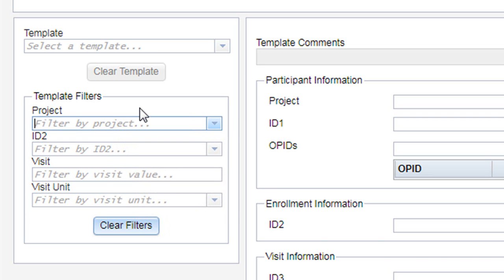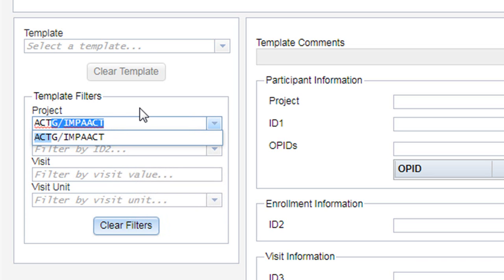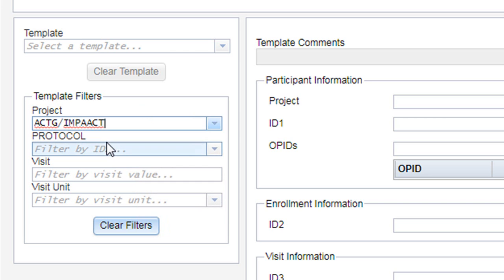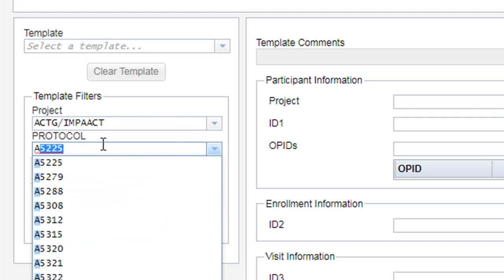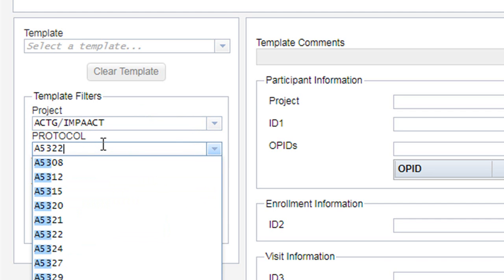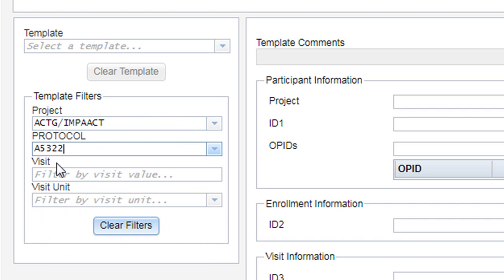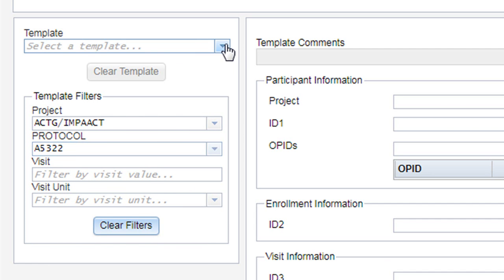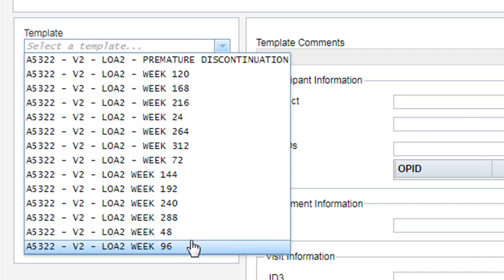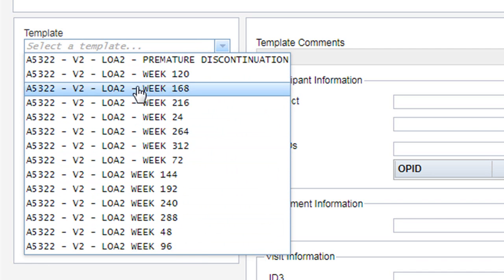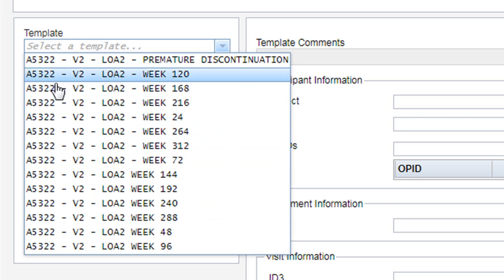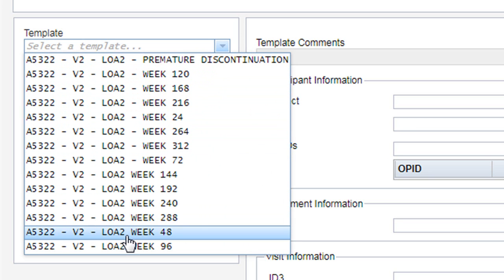You can first set the filter to your project, and then further by the protocol. Once those filters are in place, you see that the items available in the drop-down template menu are now limited to only that study for that project.